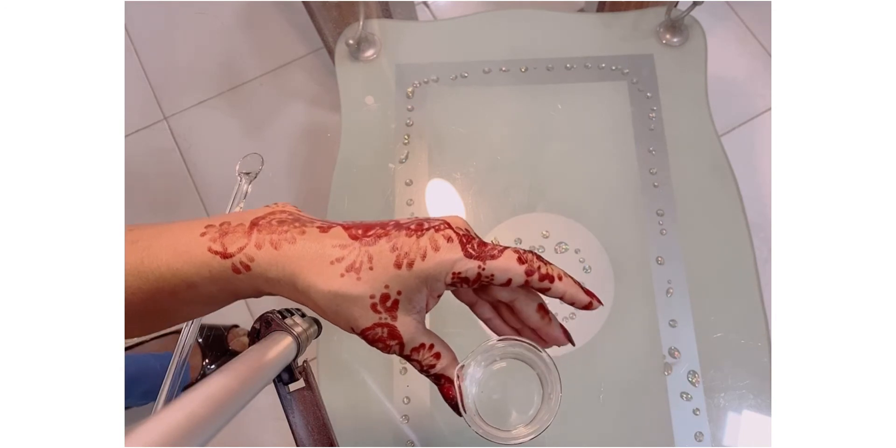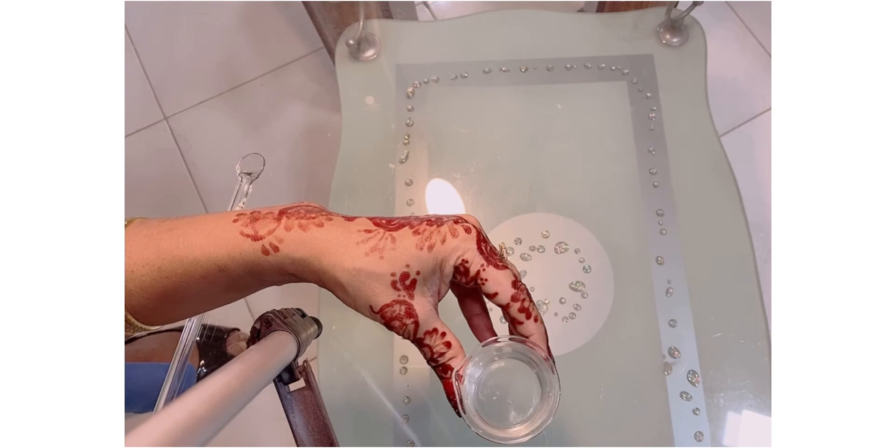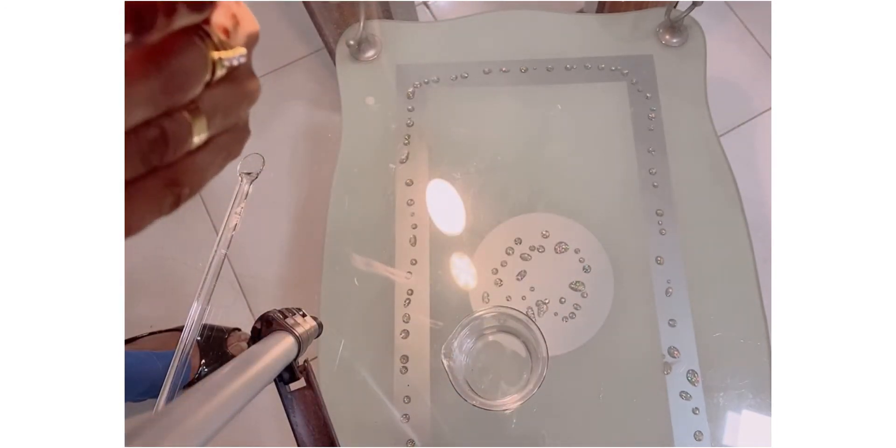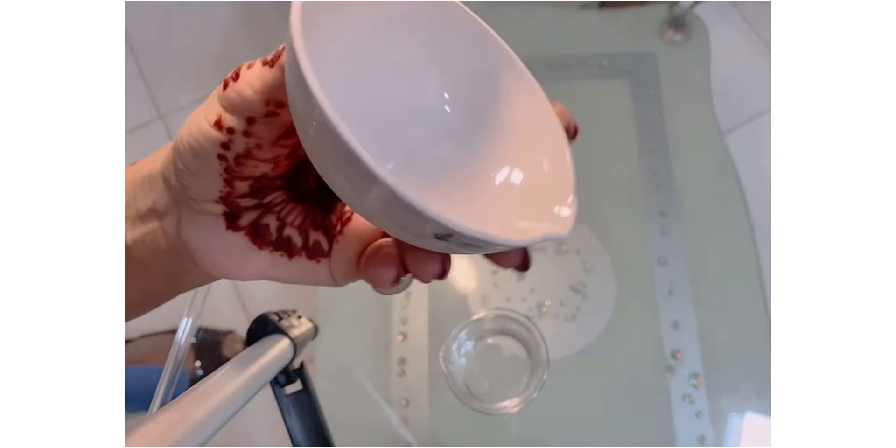And in that sense we will not be able to achieve our goal, that is to reduce the volume. The volume will remain almost the same as it is condensing back - the solvent is condensing back to the container. Whereas the china dish is different. It is basically used for evaporating the solvents much more easily.